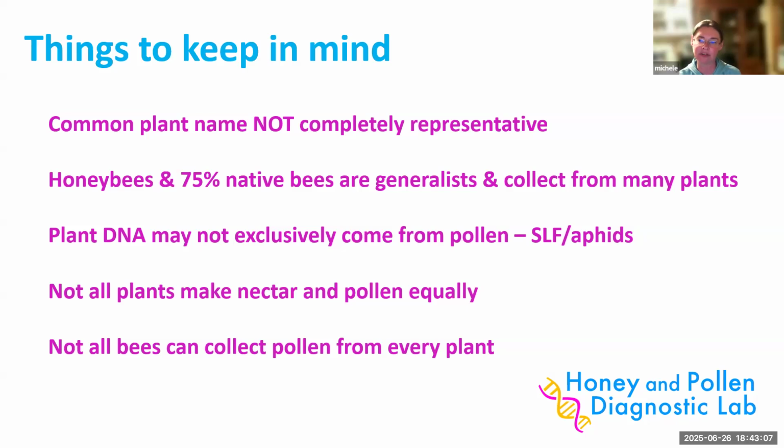We like to still offer the option to test that honey, because most people are not going to collect off of an individual frame. You're going to wait until you've got enough to bother to put the work into collecting or doing the extraction. And I totally understand that. And most people want to know, during my peak months of collection, what are the most common plants I'm seeing? I just tell people too, if you're really interested in a particular plant, you may have good reasons to do that frame collection, because you know when that frame has been filled.